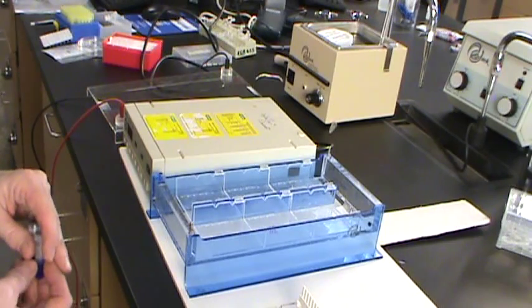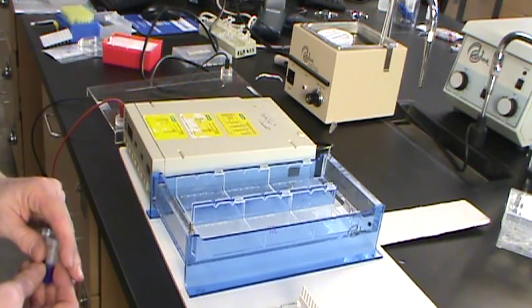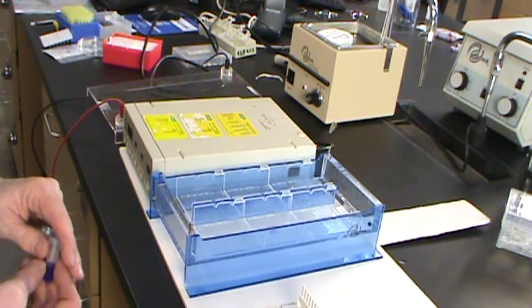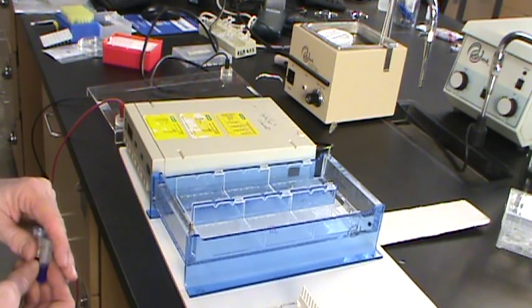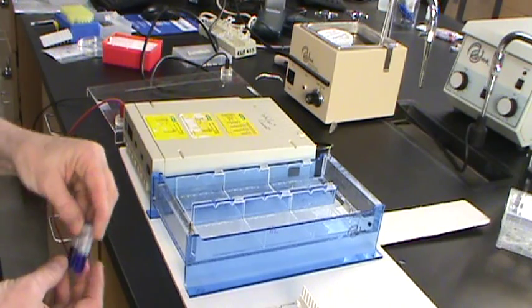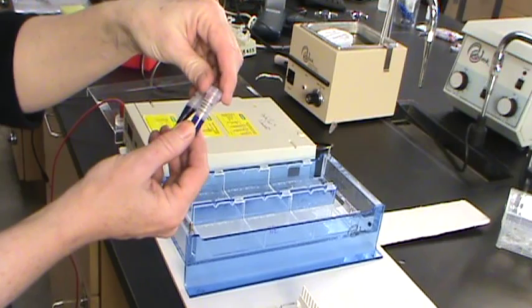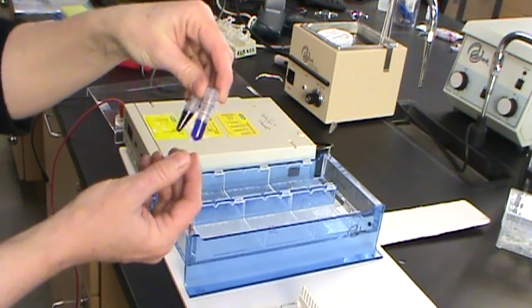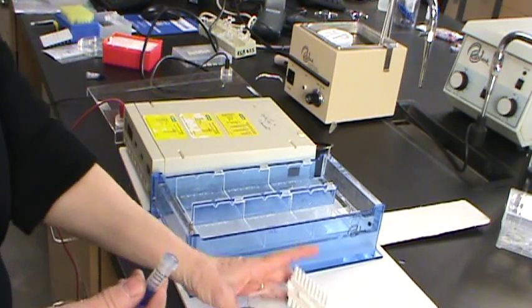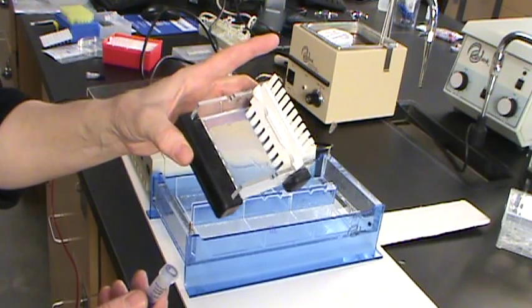While your samples are incubating, you're going to have a chance to practice loading a gel, because sometimes pipetting with these pipetters in these agarose gels is a little bit tricky. So you'll see at your station that you'll have a practice gel loading solution, and that's what you'll use for that. The gel that's provided to you may look like this, or it may already be out of the forms.